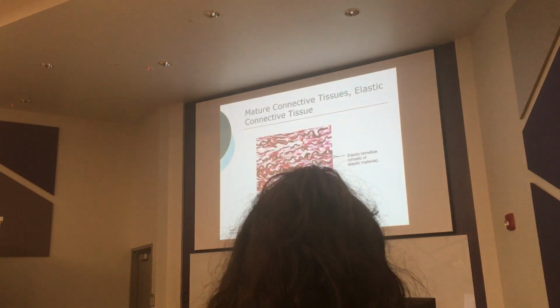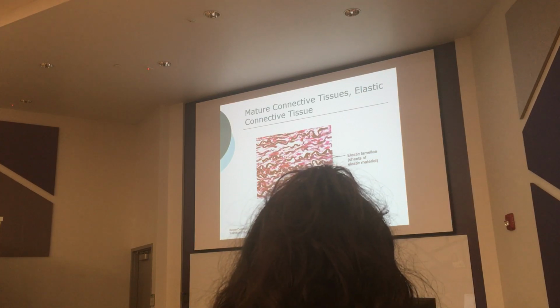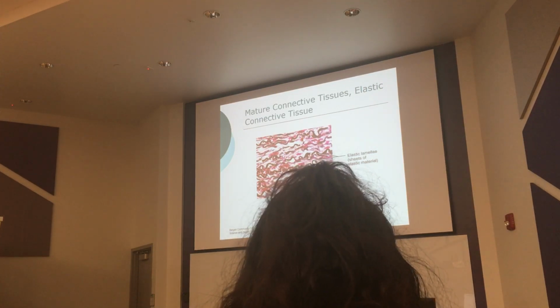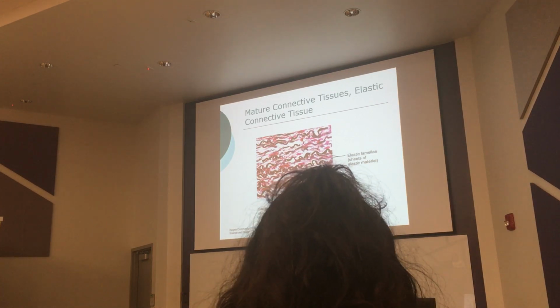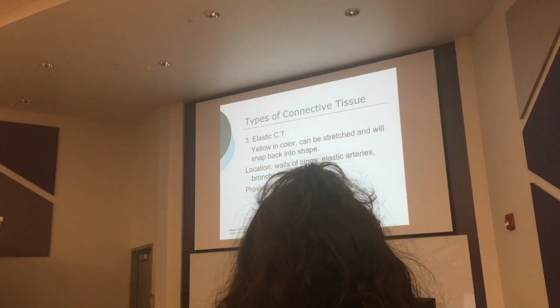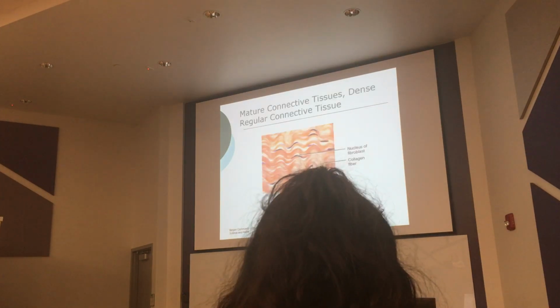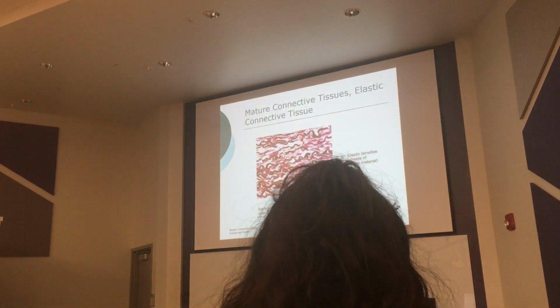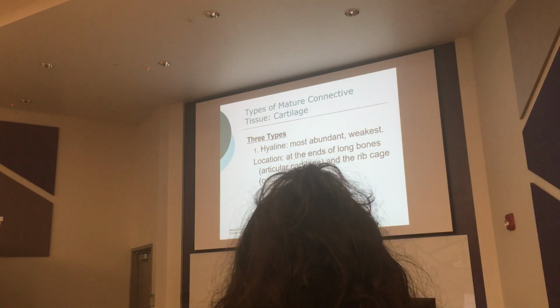So look at these here. They look like a coil, almost like rubber bands that are loosened, or almost like a spring that's loosened here. So these guys will stretch and come right back. So that looks a lot different than that. That looks a lot different than that. So they all look different once you get used to looking at them. So now we're going to go on.